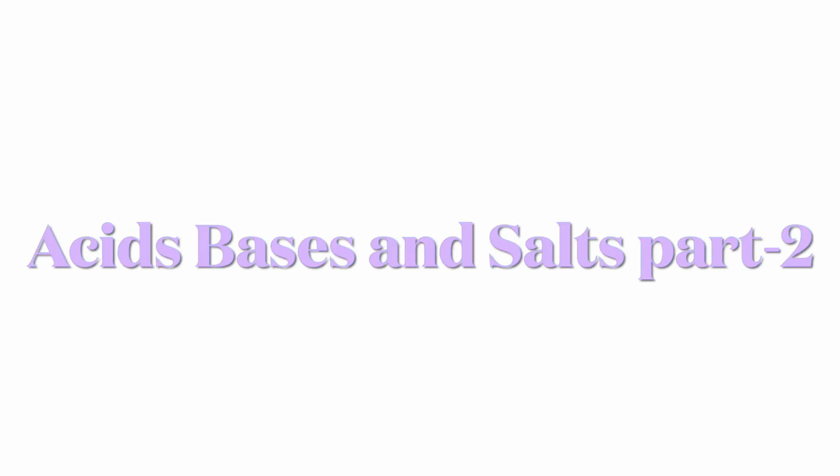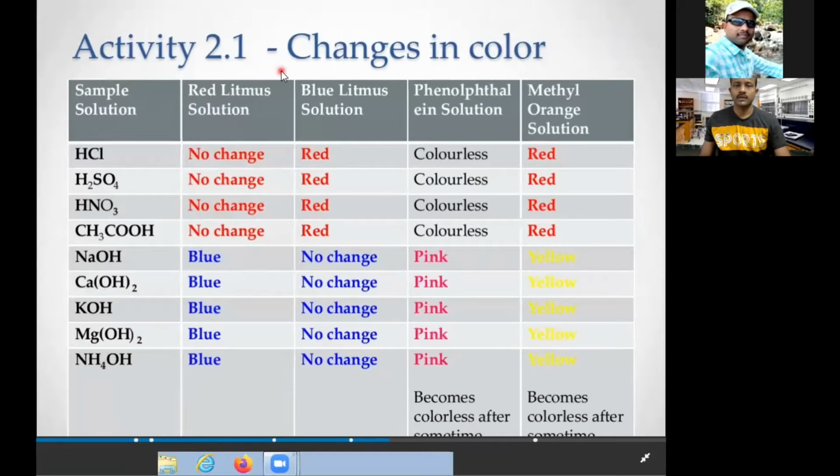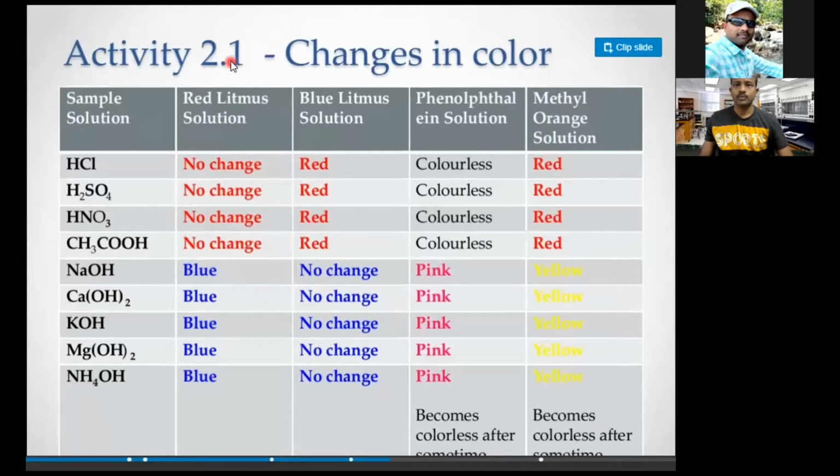Let us start activities in the acid-bases-salts lesson. What is activity 2.1 we have here? You see here some of the activities given in your textbook. Activity 2.1, so the changes in the color you see.